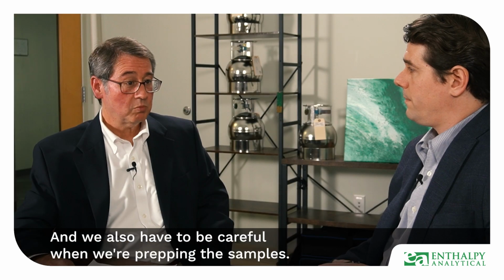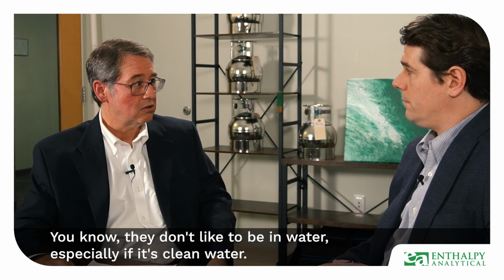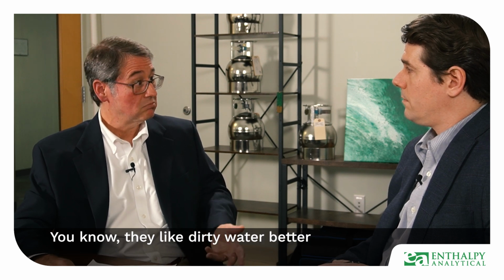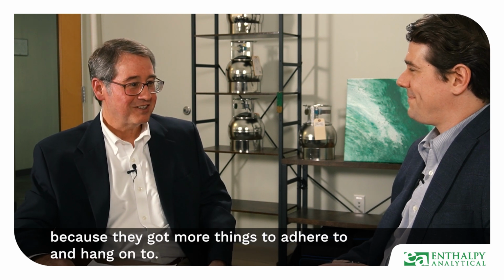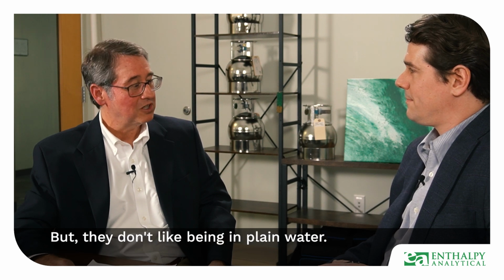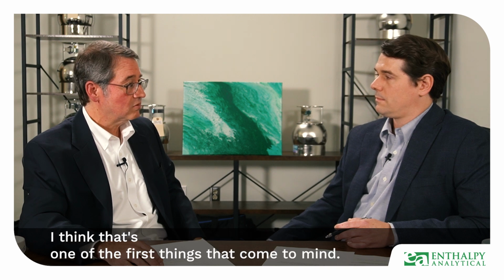Right. And we also have to be careful when we're prepping the samples, because those C18s, they like to stick to the bottle that they came in. They don't like to be in water, especially if it's clean water. They like dirty water better because they've got more things to adhere to and hang on to, but they don't like being in plain water. So just the chemical diversity of the compounds we analyze for, I think that's one of the first things that comes to mind.